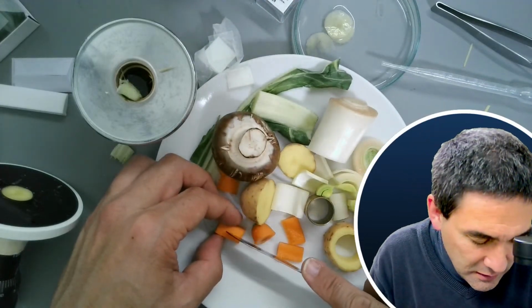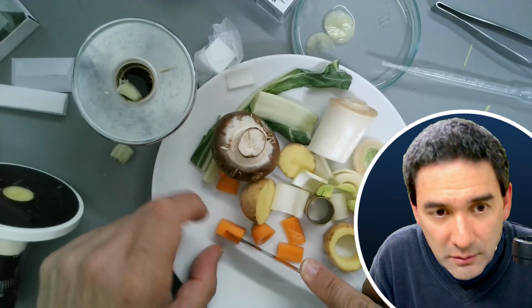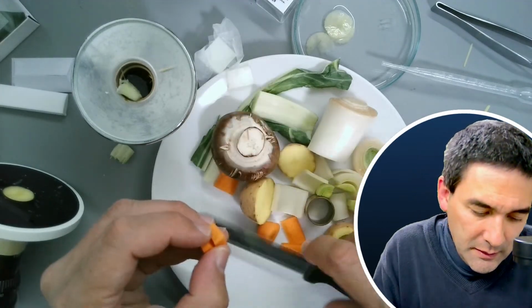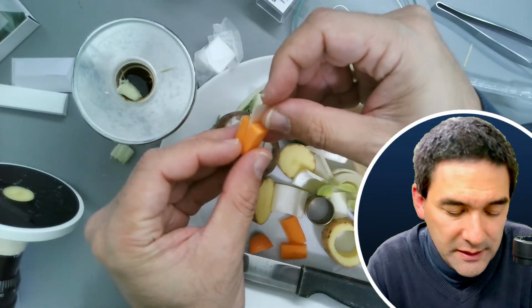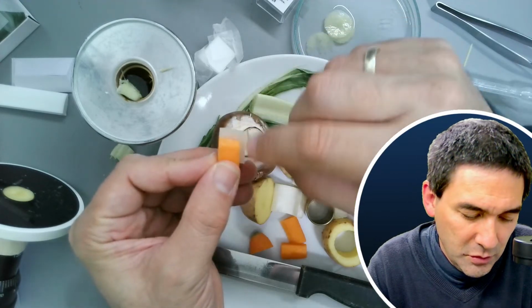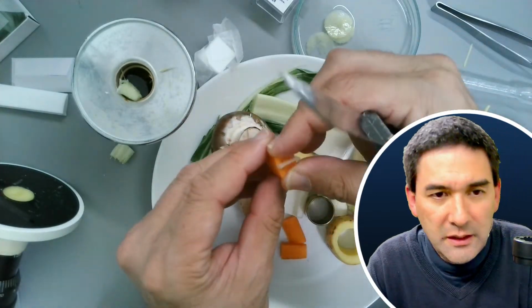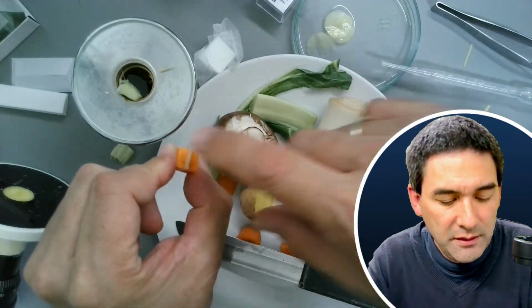I basically cut it up to here, and I keep it connected here. And then I will put it in here like this. It's a little bit too large over here, so I might remove this. So the carrot essentially has now become the holder for this thinner specimen.